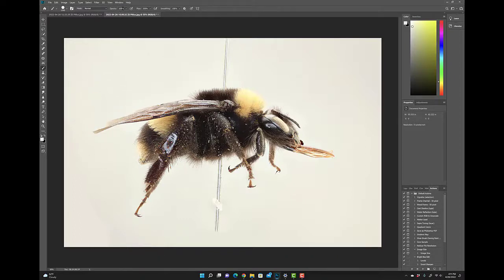If it's not faded enough, you can change the opacity at the top. So it's at 100%, now we're going to go to 50%, and that can balance and tone it out just a little bit more as well. Do the same thing on the top. And if you wanted, you could remove the pin altogether if that was what you're after. But either way, you can see that did not take very long.